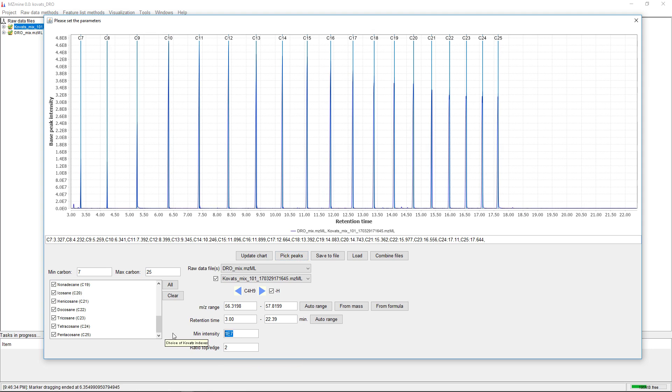We should be able to pick all the peaks again. It's just a matter of retention time window, minimum intensity, and ratio top to edge.